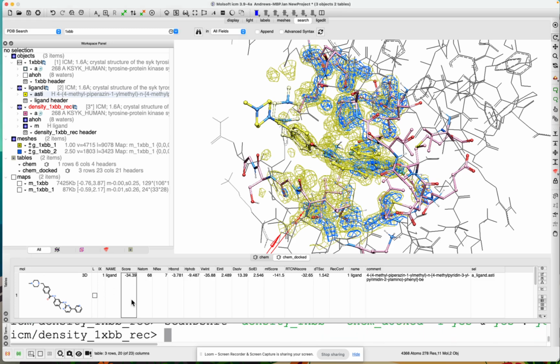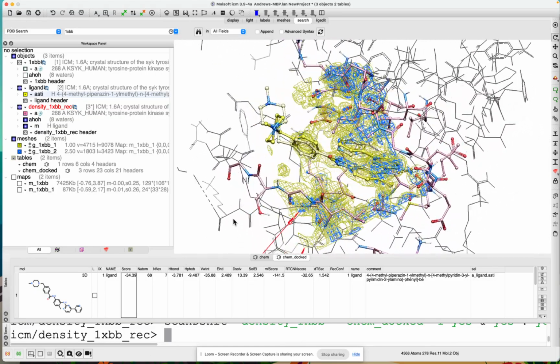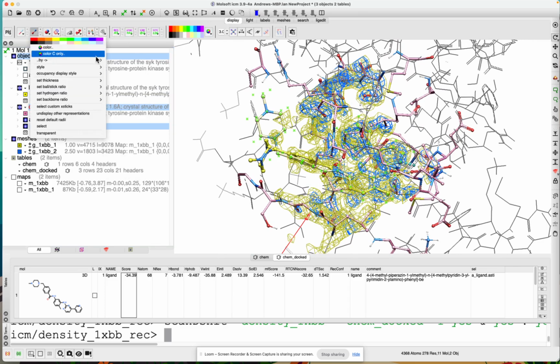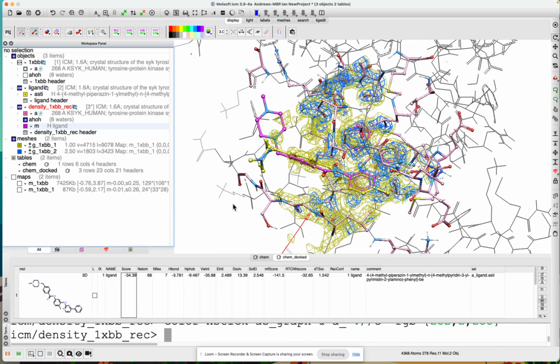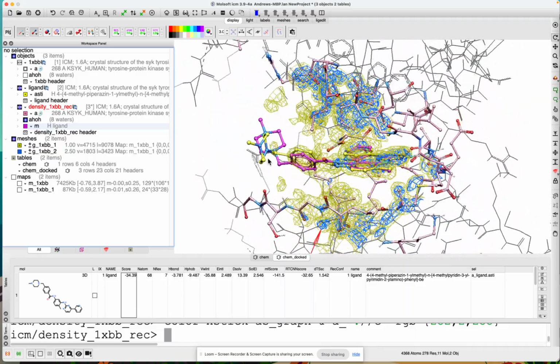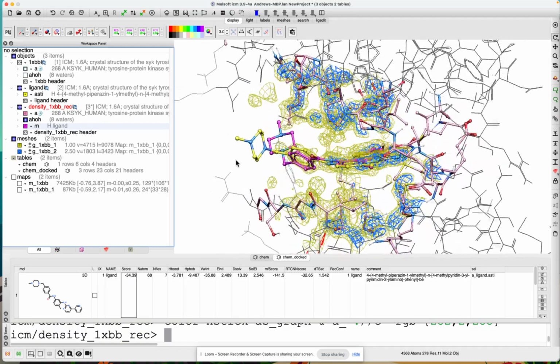And single click on the hit list to load the ligand in. So the docked one is colored by, I'm going to color C only, magenta, and the yellow one is the X-ray structure. So you see it tried in this sort of solvent exposed region. The crystal structure has the ligand pointing out into the solvent, which is fine.